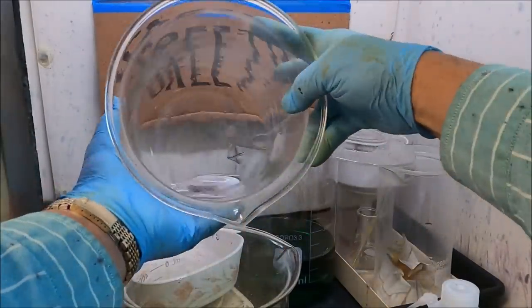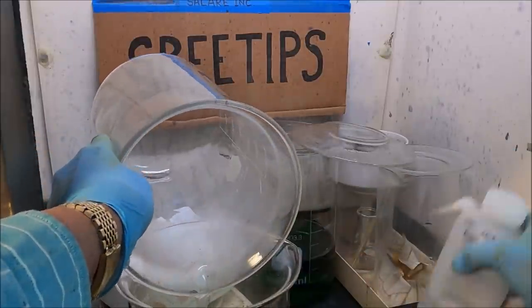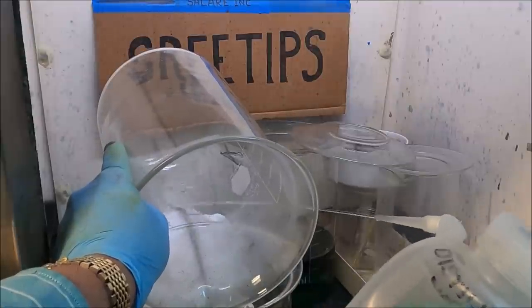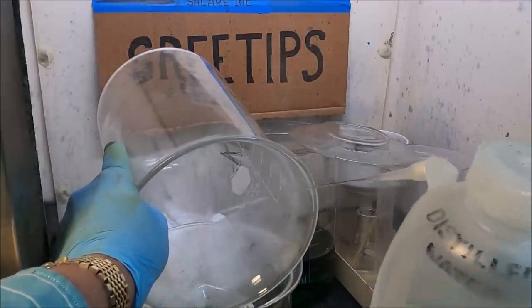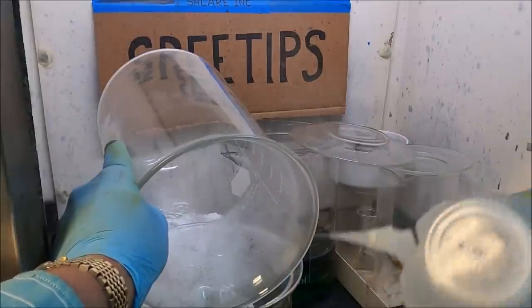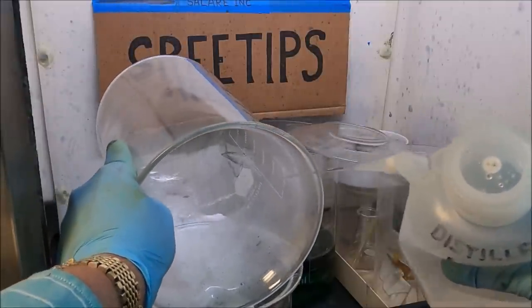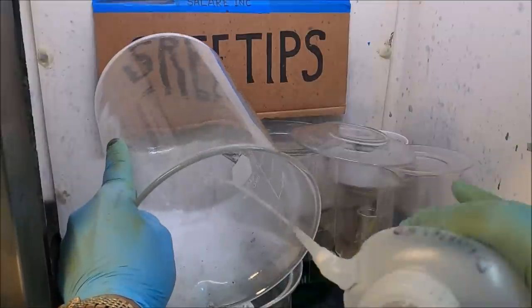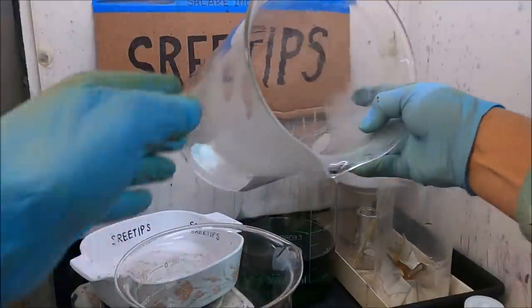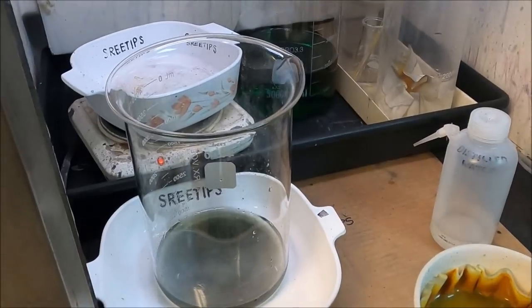Here somebody's gonna fuss me out for pouring this stuff towards me. I don't care, man. I gotta facilitate the camera here. If you want to complain to me about the way I do stuff, that's just fine. I add acid to water, I pour caustic and corrosive solutions towards me, and I do all kind of dangerous things in here, but I do it for the benefit of the viewers' videos.